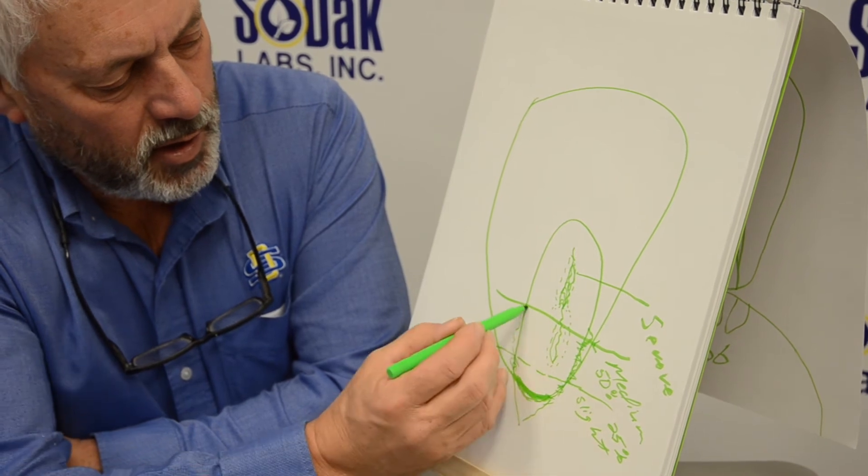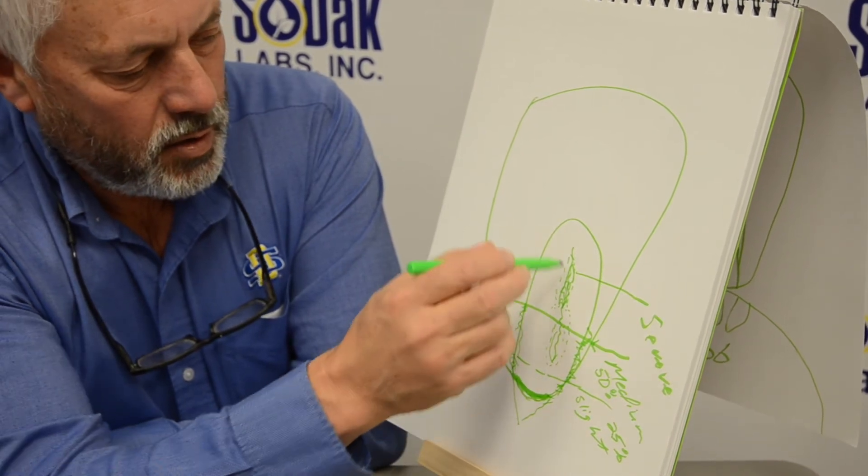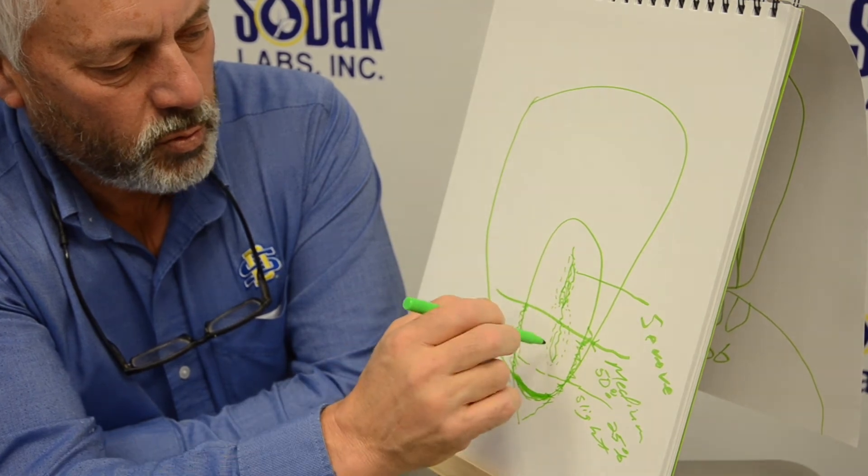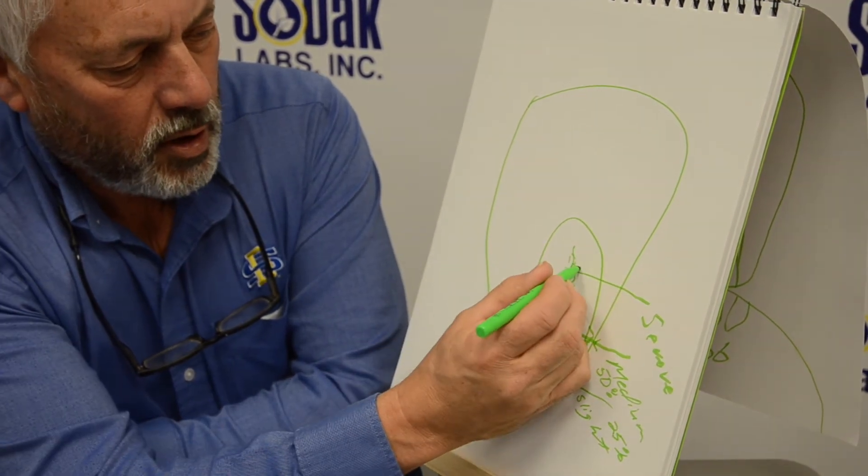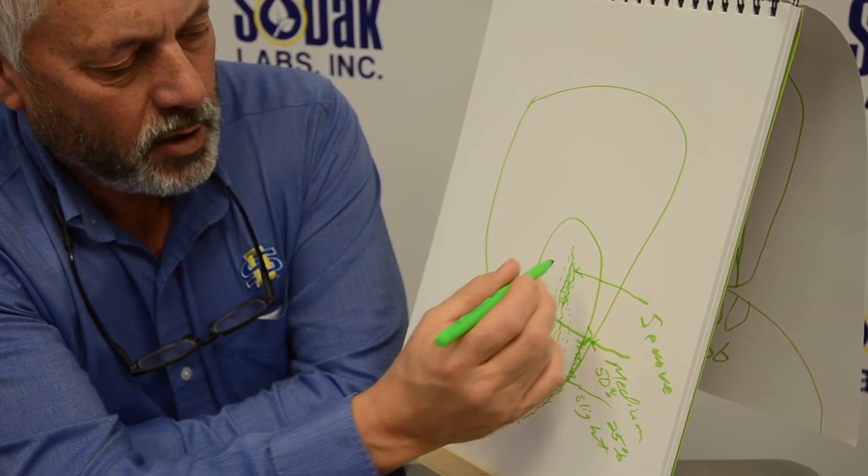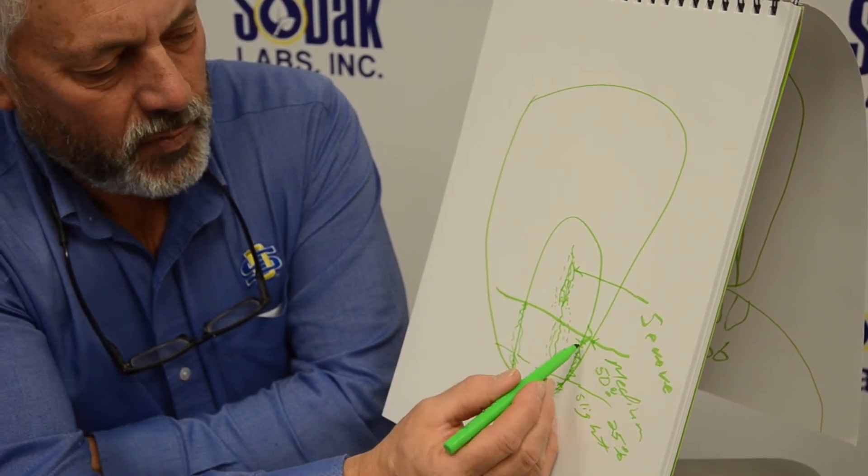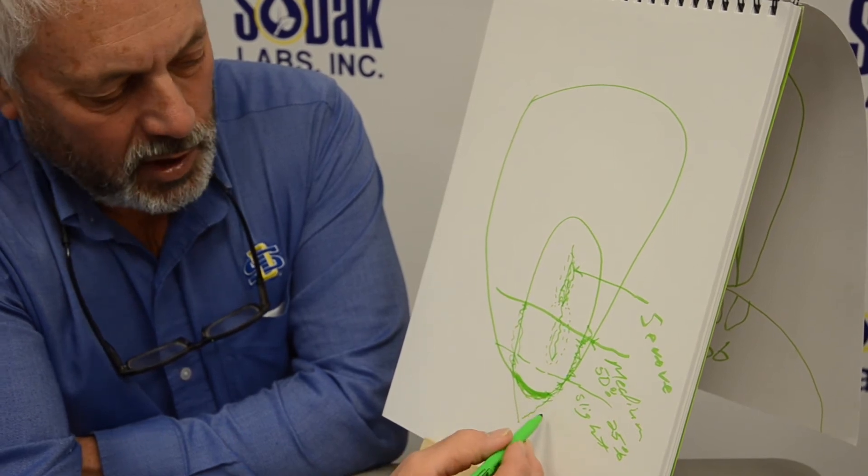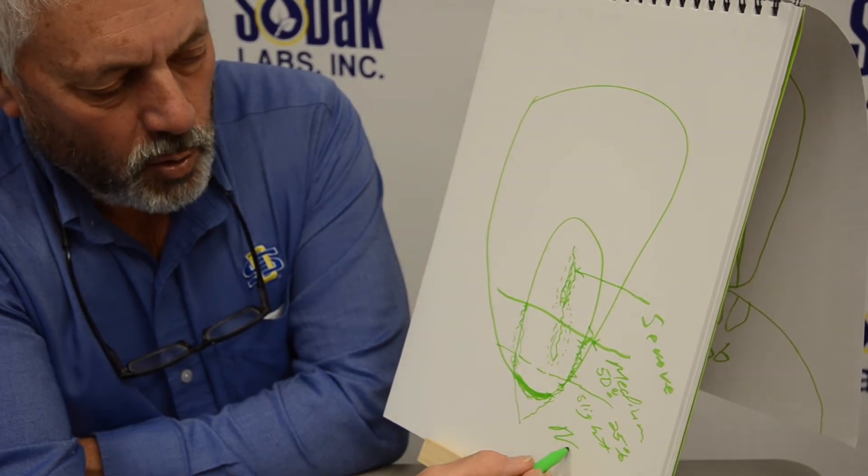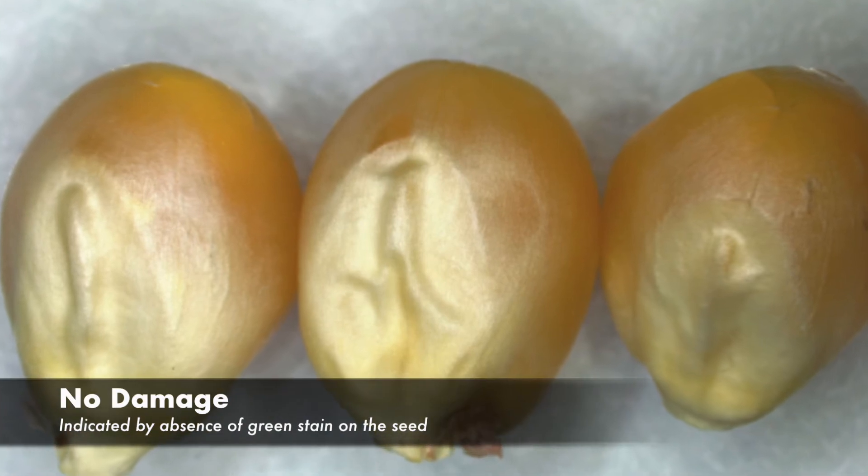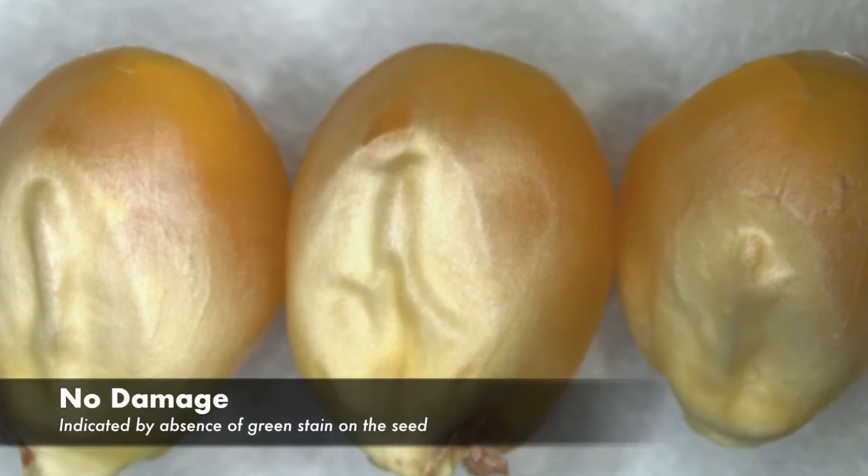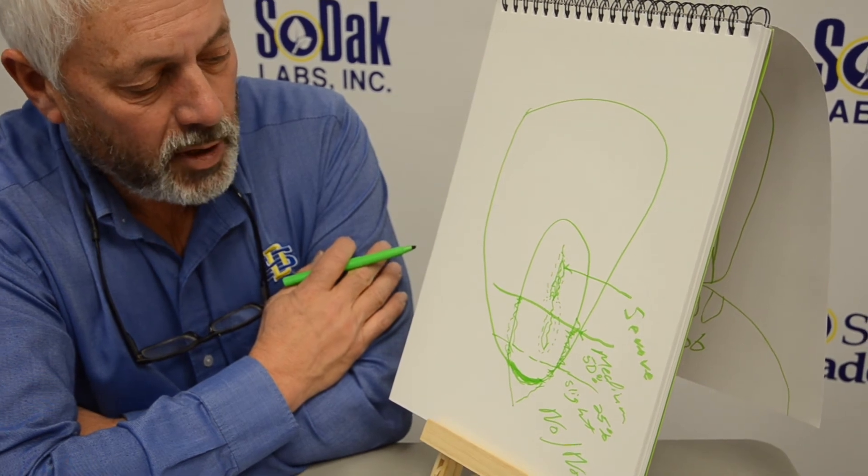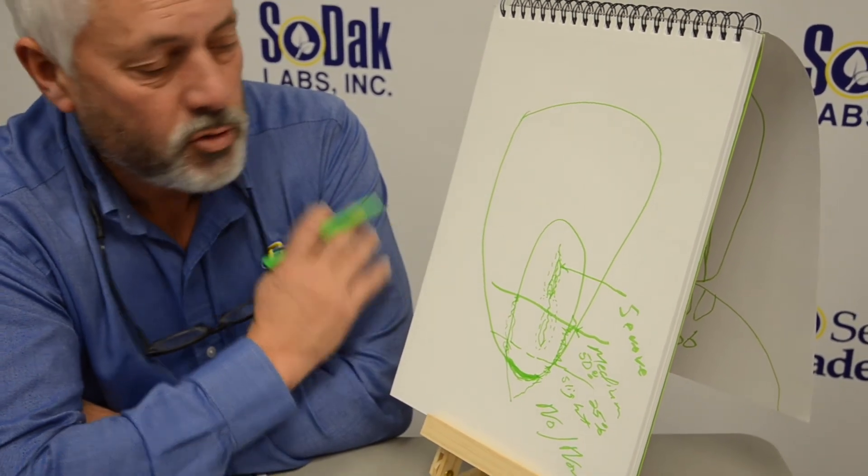So the damage is just along here, it's not in the embryonic axis here in the shoot or the root. That would be severe damage when our cracking or damage is right here. Medium is just on the margin here, slight is here, and we can have none or no damage. That's like a perfect kernel, there's no tearing, abrasion damage, and there's no impact.